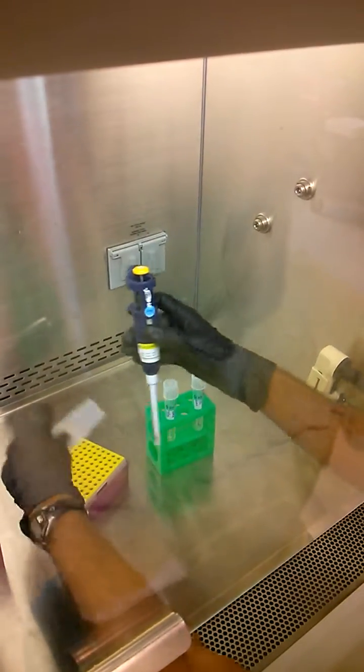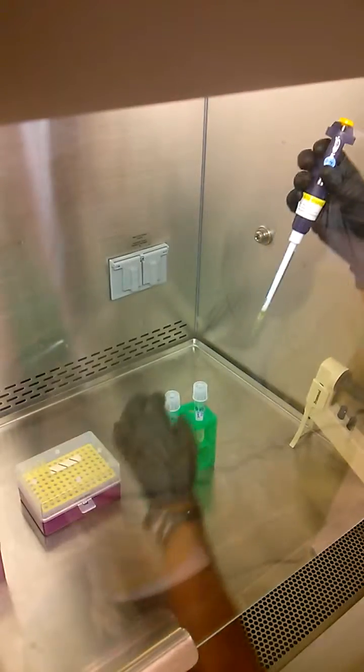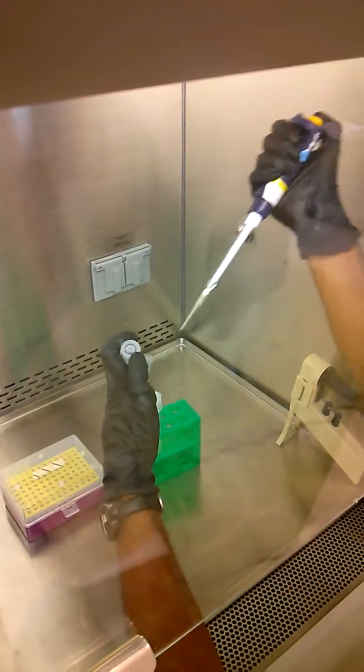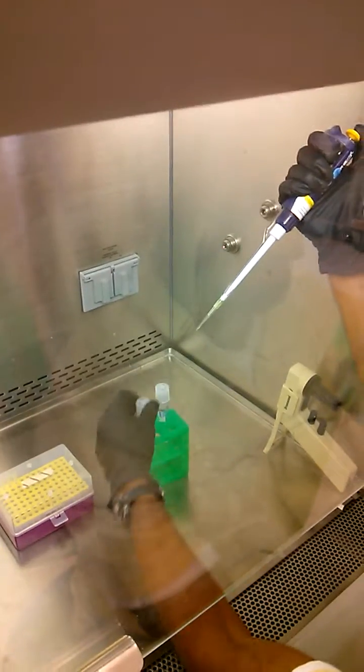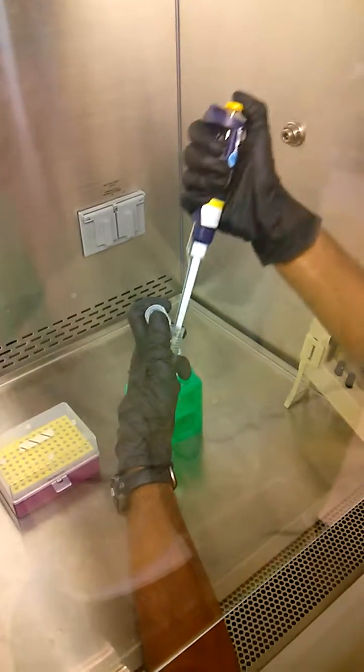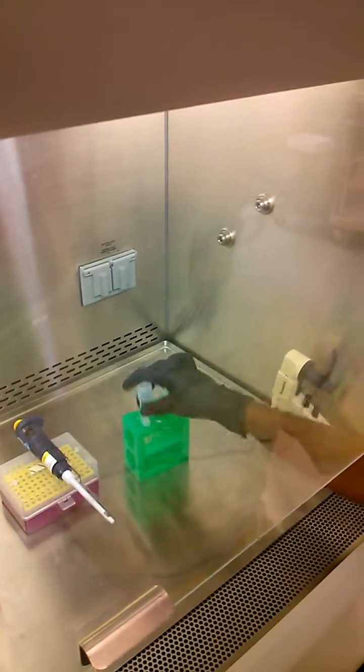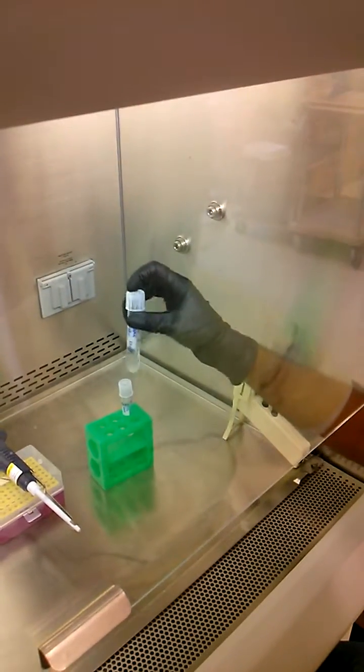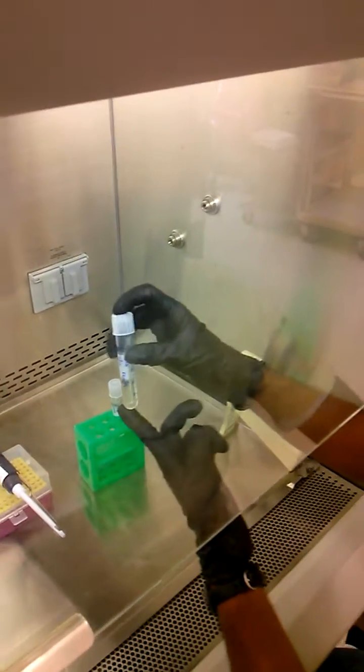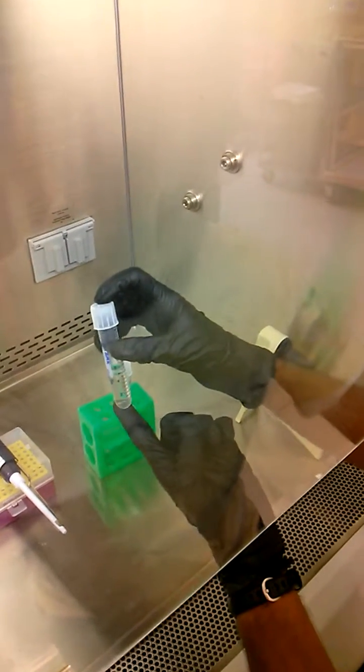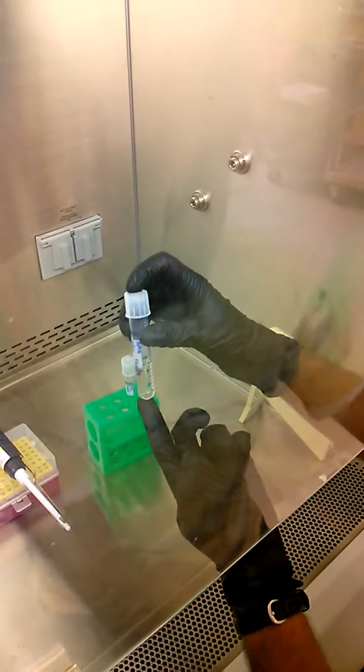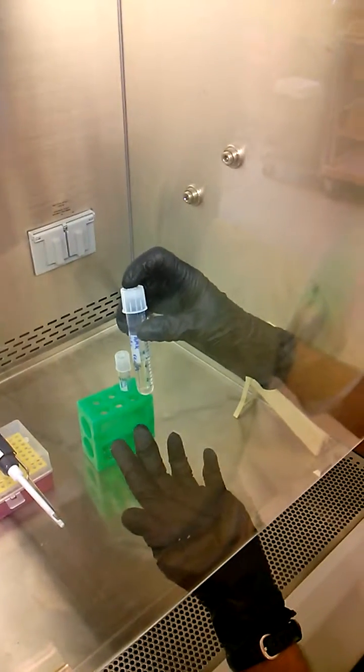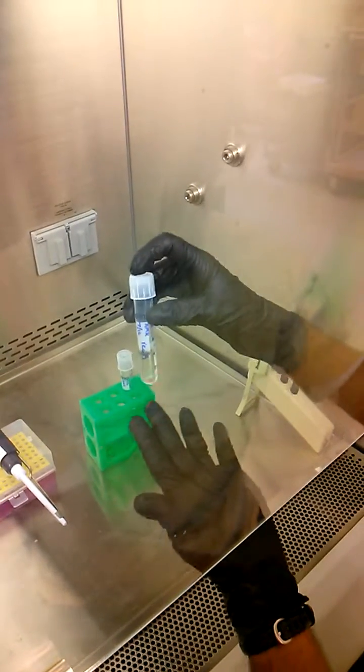So now I'm just going to simply do a 1% inoculation of the new culture. And it's very critical that the OD for this be watched closely and that P1 phage be added when the OD is around 0.15 or 0.25, basically between that range.